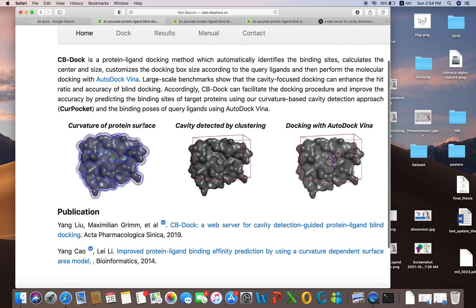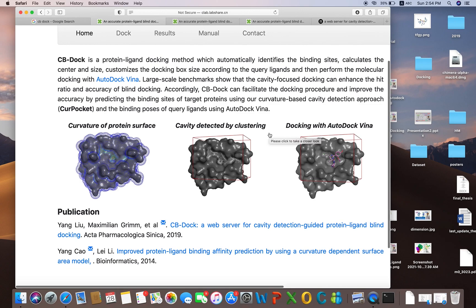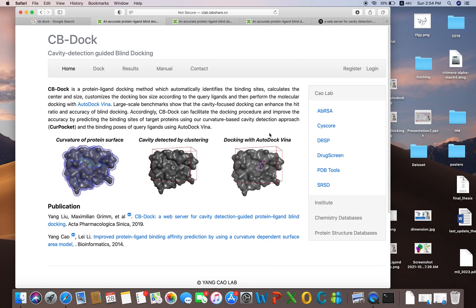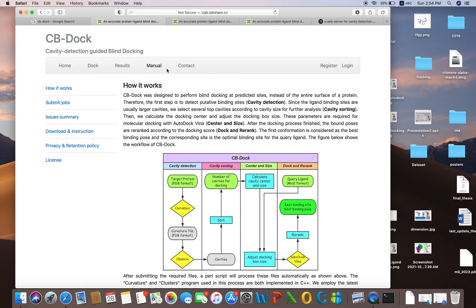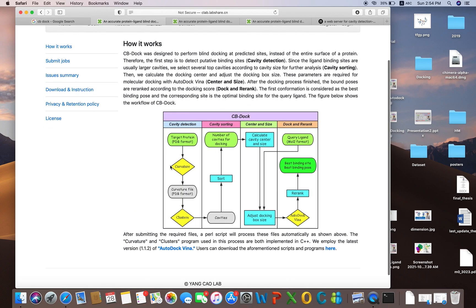First the curvature of the protein surface will be detected by the server, and after that the cavity will be detected by clustering. Then docking will be performed using the AutoDock Vina program. If you want to know more about it, you can click on the manual, where it is mentioned how it works and how it performs the docking.